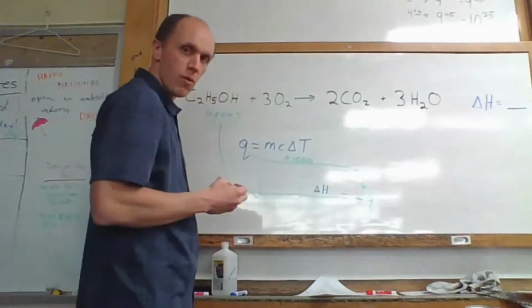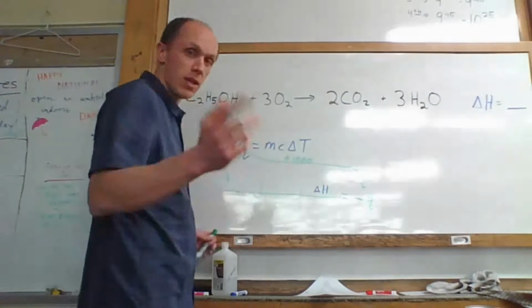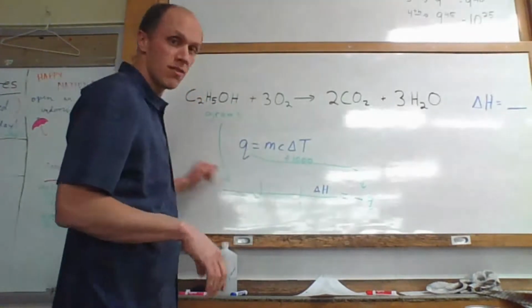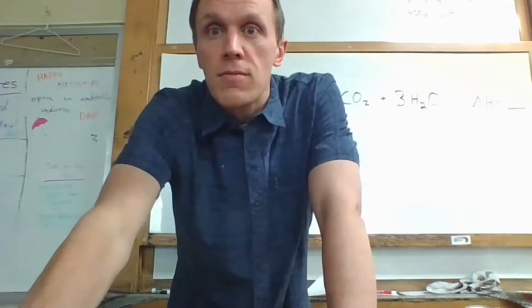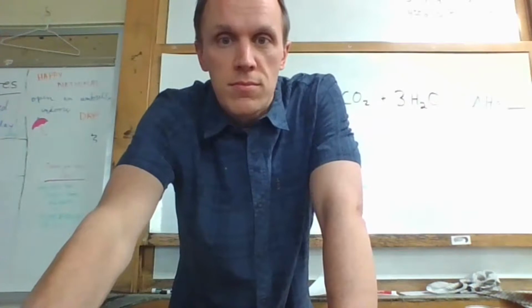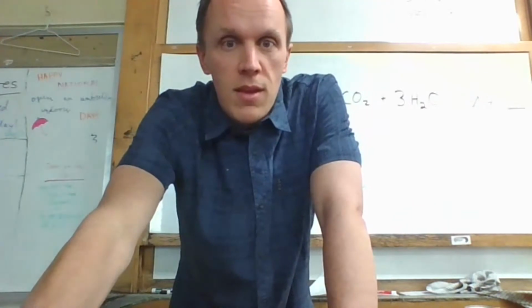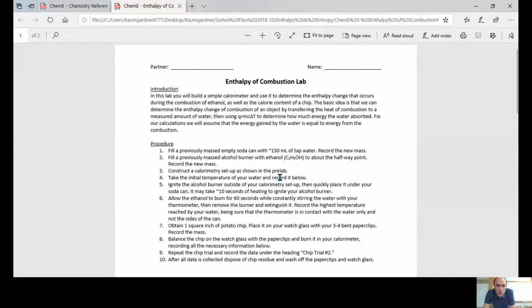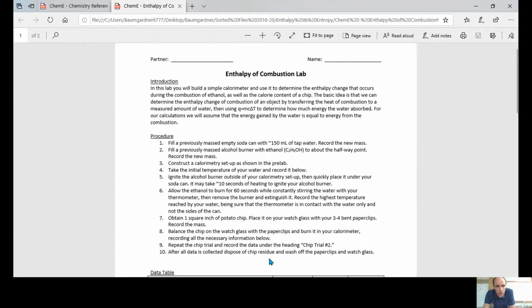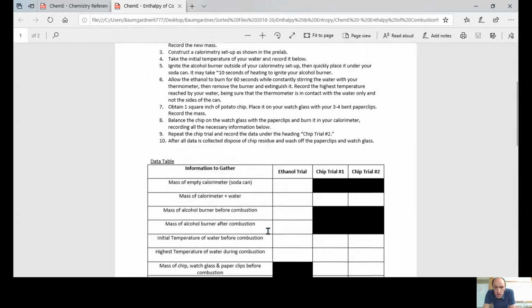All right, the worksheet you're looking for should be under the assignment section. I'll go ahead and share it on the screen in just a second, and I'll show you our setup. All right, it's this little guy right here. So make sure you've downloaded this. We've got a procedure here, but I'll be walking through it, and I've made some changes to it.